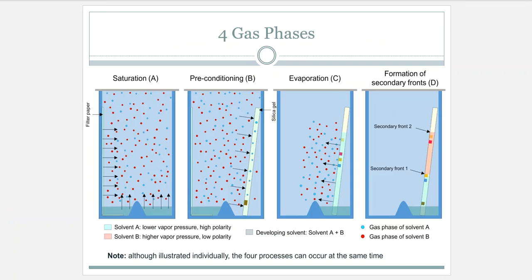And here's an image that I would like to share with you, maybe a visual representation of what we're talking about here. It's going to allow me to go into a little bit more detail versus just the basic straight up definitions that we've discussed. So the first one is saturation. In the very first image that you see on the left, saturation is taking place.